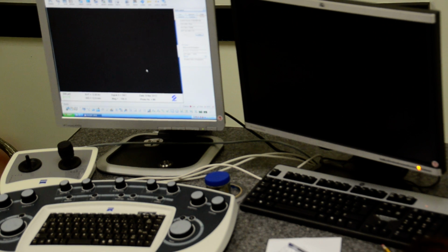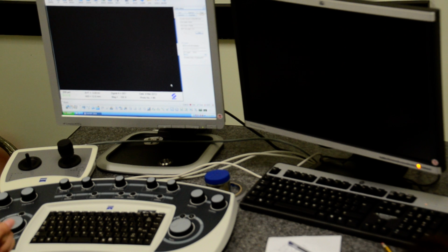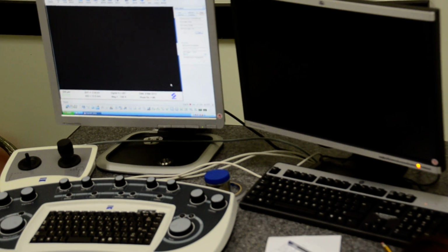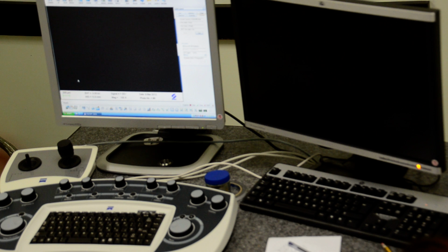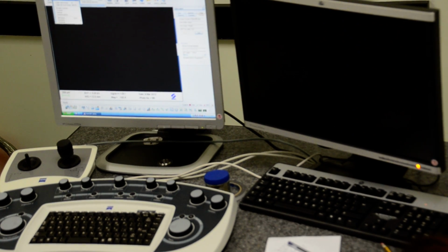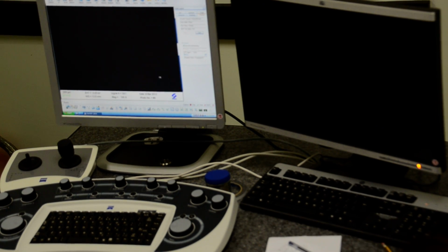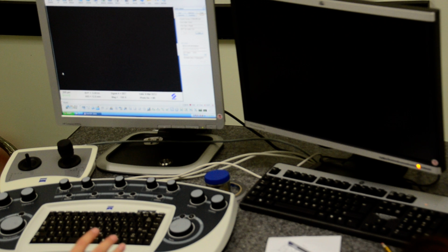Okay. So you can let your group member use this particular data zone, so then you can differentiate. Just let them log in to the user account, go to the data zone, load that particular data zone, then the problem will be solved. Okay, but how you're going to customize this one, I will need to do that.